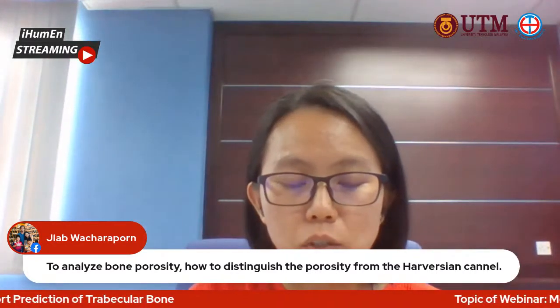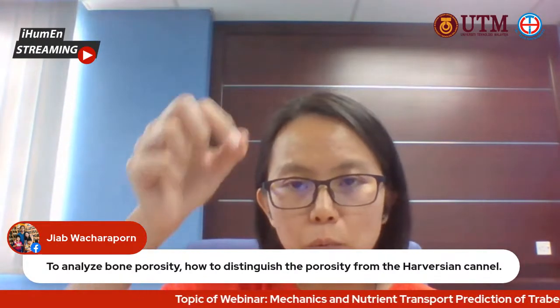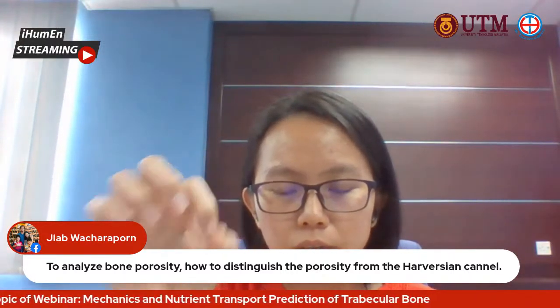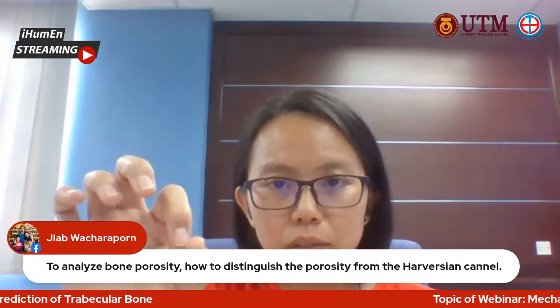To answer your question, how to differentiate between the bone porosities and the Haversian canal, it's mainly based on the structure. The Haversian canal is a tube shape, it's a network, whereas the porosity of the cortical layer, the pore size, is normally of irregular shape.